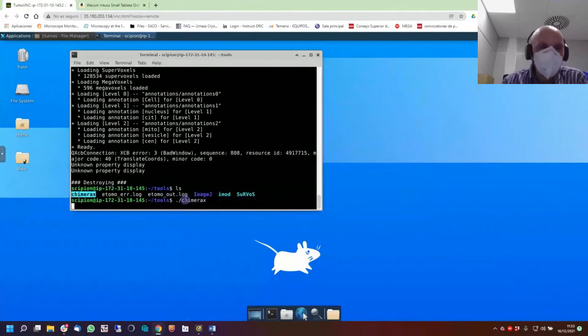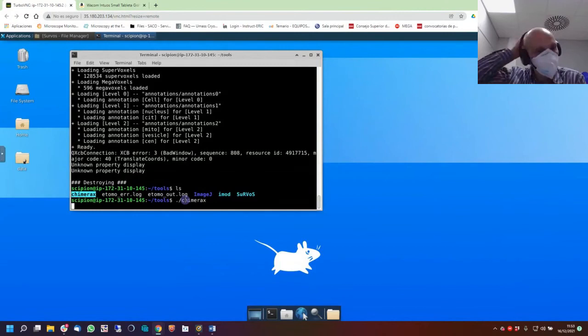I told you that I'm more used to Chimera due to the old Chimera stuff, but it's more or less the same. So at that point, we can play with this for a while and show you how to handle this type of data, masked data.